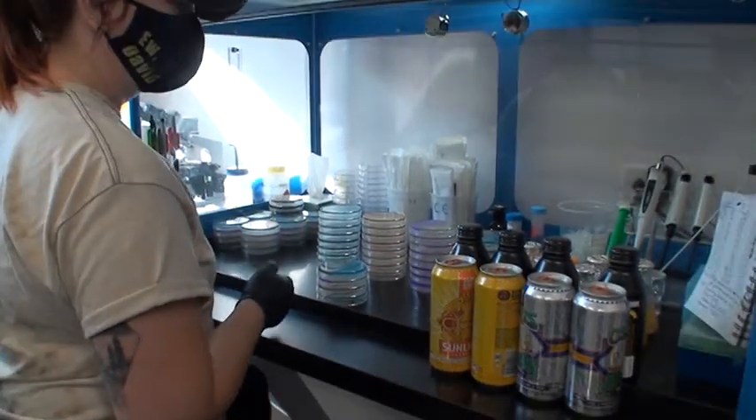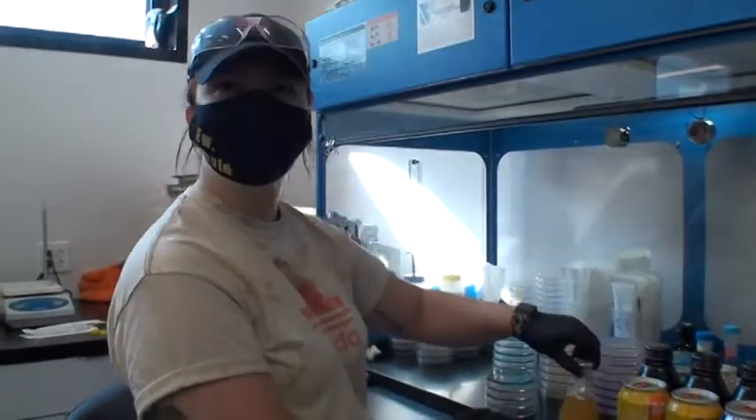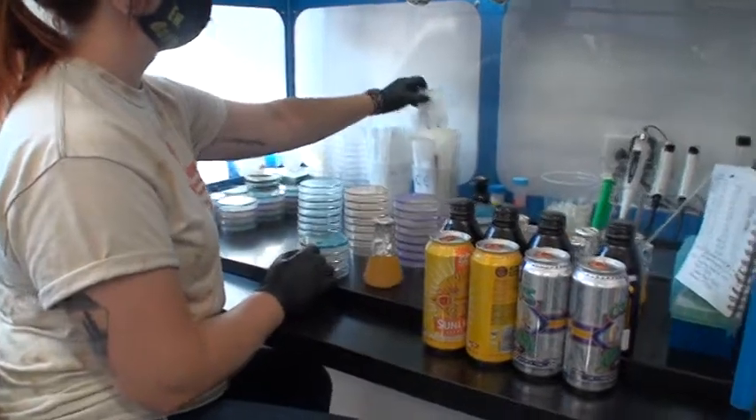Alright, so this is Megan here. Hi Megan. She is in charge of all of our biology micro program.